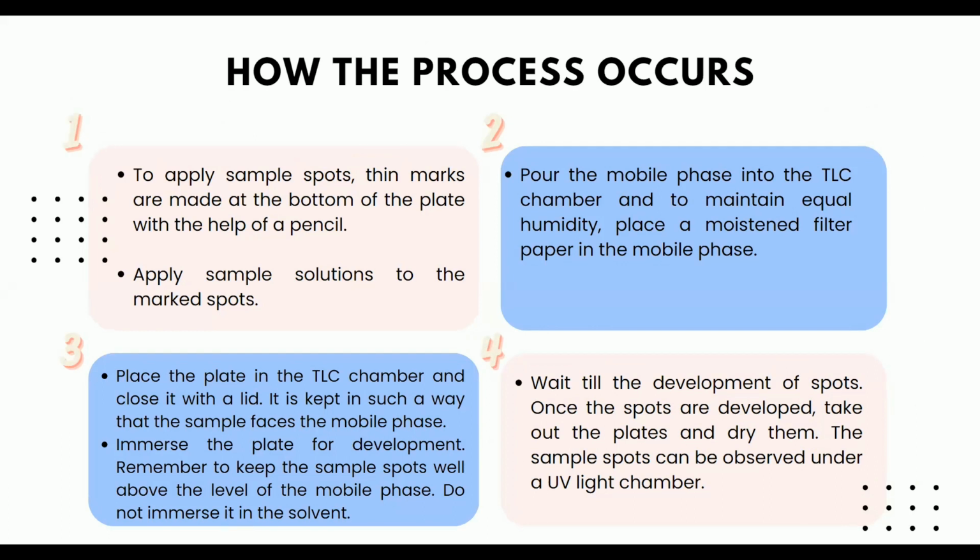3. Place the plate in the TLC chamber and close it with a lid. It is kept in such a way that the sample faces the mobile phase. Immerse the plate for development. Remember to keep the sample spots well above the level of the mobile phase. Do not immerse it in the solvent.